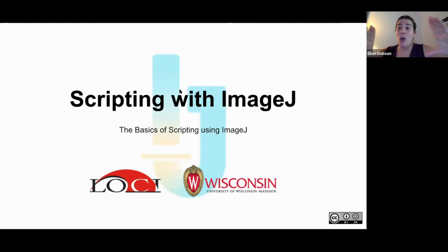Because remember, when we blurred our image and tried to improve our signal to noise ratio in order to segment our objects, once we had that segmentation and those ROIs, we applied the ROIs to the original image, which we did not touch the pixel values of. That is why you want to do your measurements on the original image that you did not apply any of those pre-processing filters to. Does that make sense?